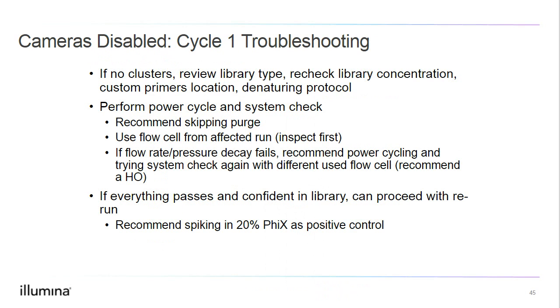If no clusters were detected from the focus images, then this indicates a clustering failure. To troubleshoot, first review the library type sequence. All Illumina libraries are compatible with the NextSeq, but if third-party libraries were used, we would want to verify their compatibility with Illumina sequencing primers. If custom primers were used, verify that they were added to the correct location and were selected appropriately during run setup. Then, recheck the library loading concentration as well as the sodium hydroxide concentration and pH.